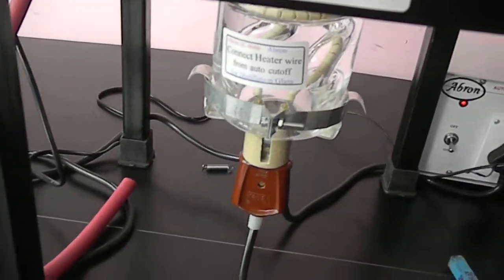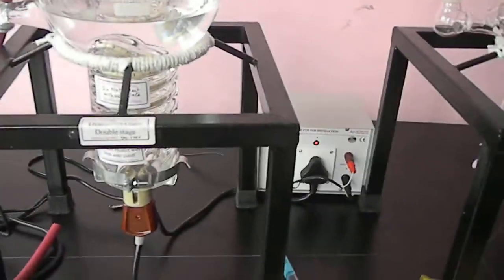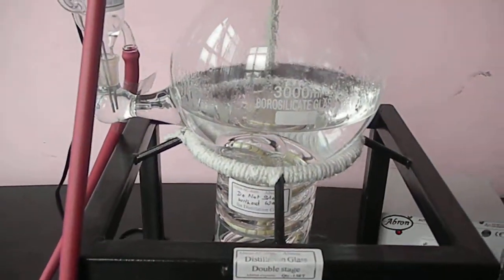Now the attachment has one heater which is connected to the distillation. And then this heater is connected and the probe is there and the water is put. Now fitting is very easy.